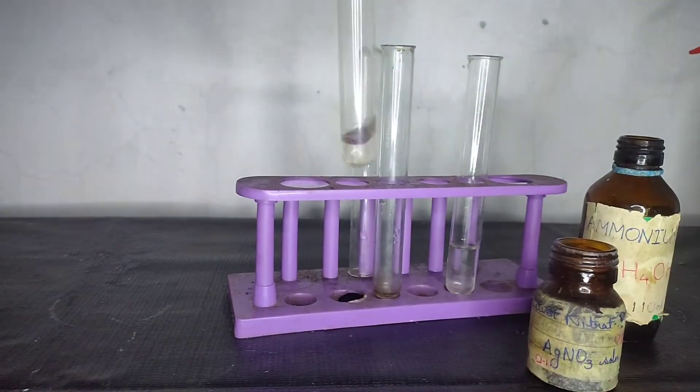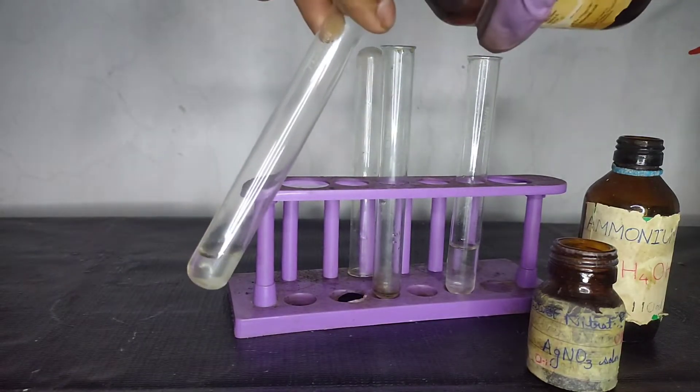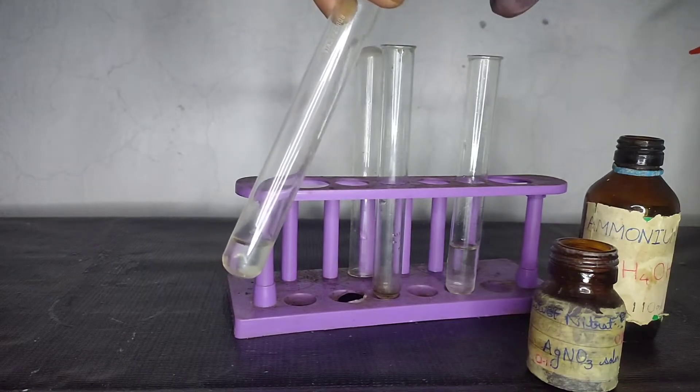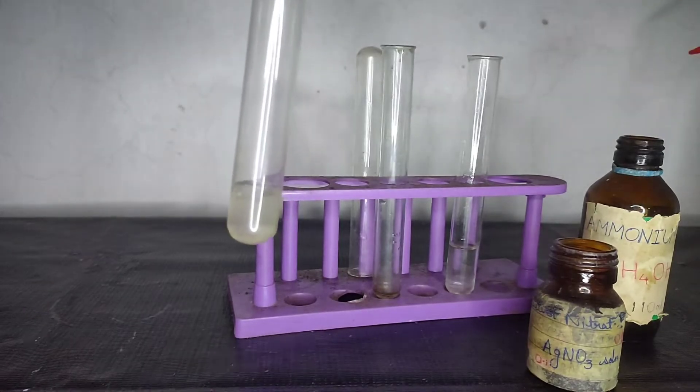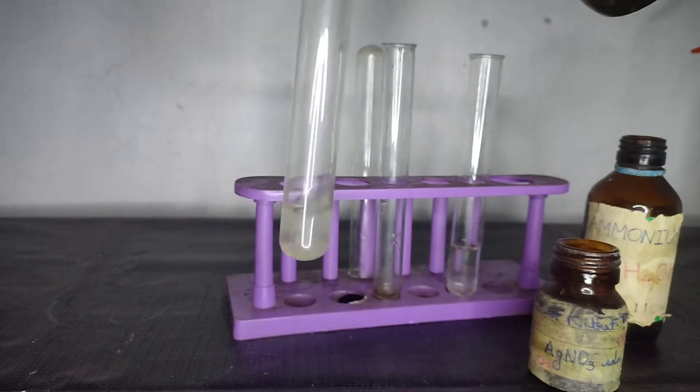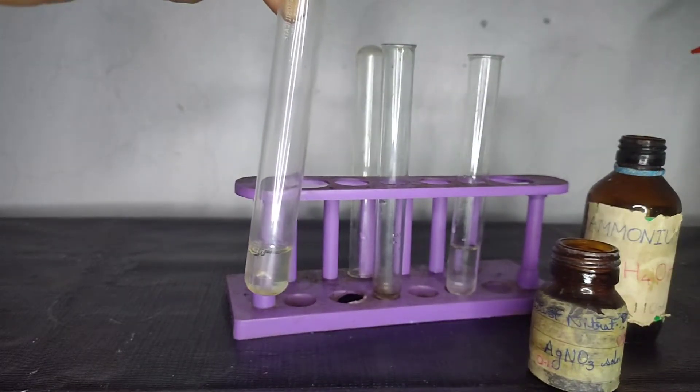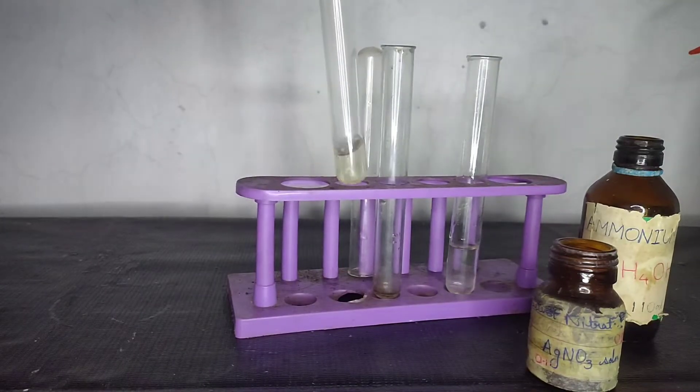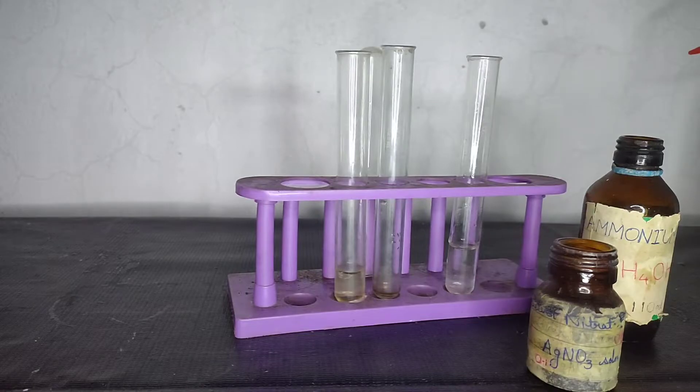Now to this solution, we first need to acidify it with dilute nitric acid. After acidification, now we need to add silver nitrate solution into this.